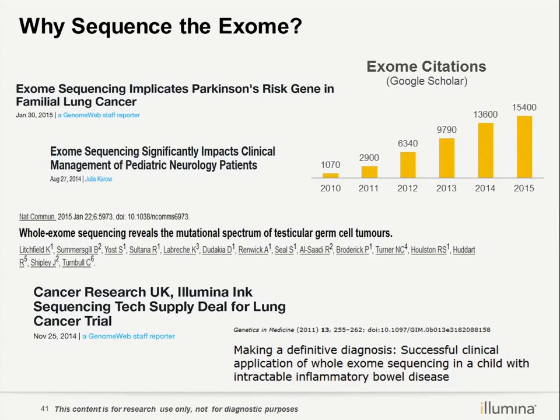To sequence a human exome, normally maybe 5 gigabases of data throughput is enough. If you would like to sequence a whole human genome, it requires at least 90 gigabases. So we can see the exome is a more economical way. And because the data you get is much smaller, the analysis and data storage are simpler. That's why people select exome sequencing rather than whole genome sequencing.